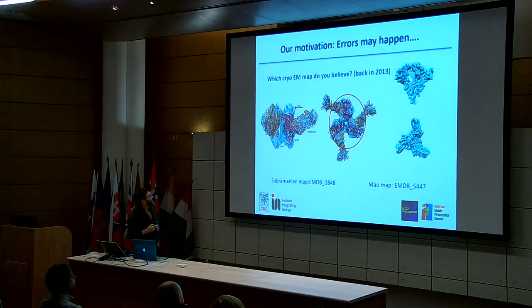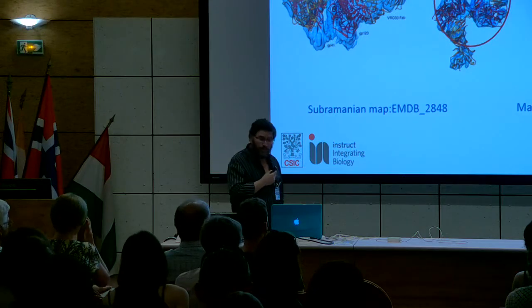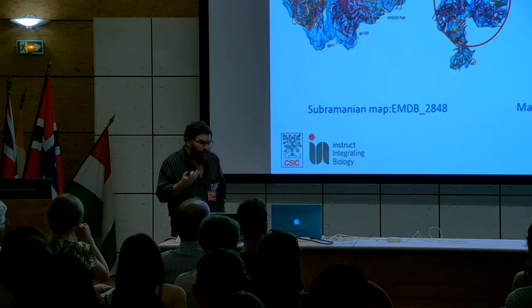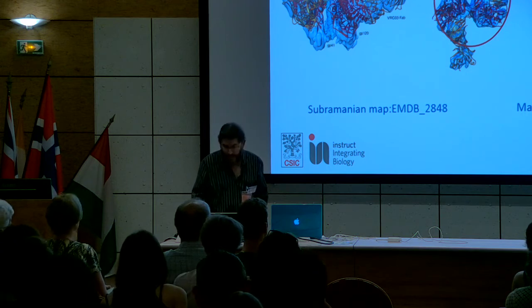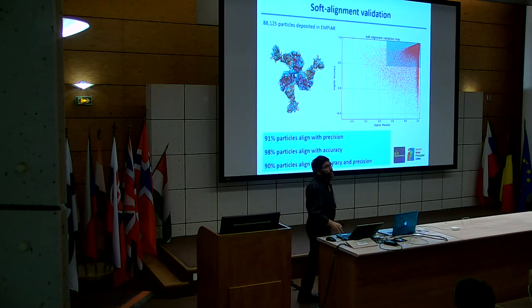And Siran is laughing. This is a very important controversial issue at that time, in which GP120, the trimer that Siran was telling you about, and these are one structure from his group, another structure from another group. They are very different. So at the time, it was a controversy, which one is correct and why. Well, with our quality figures, there wouldn't have been any controversy.